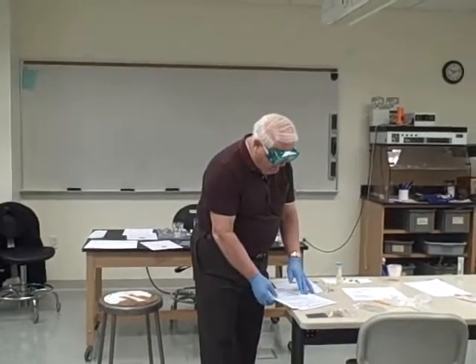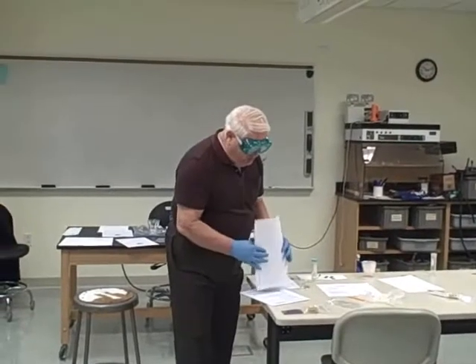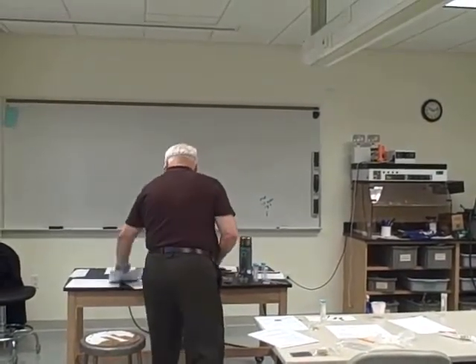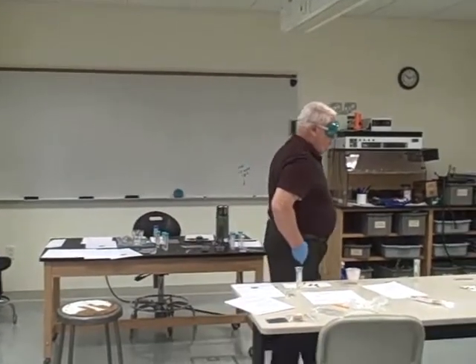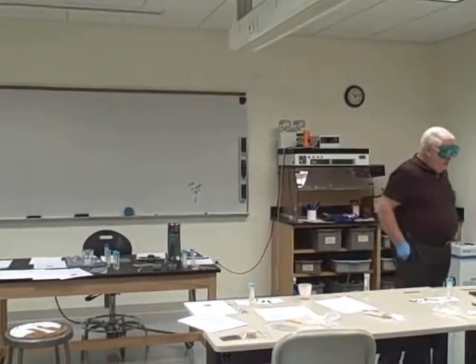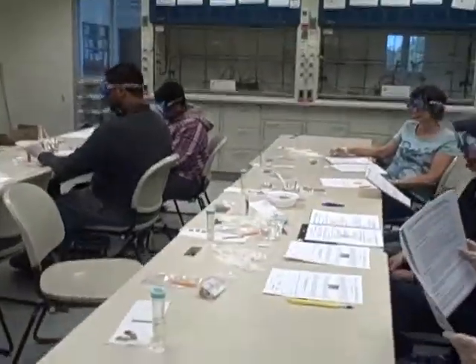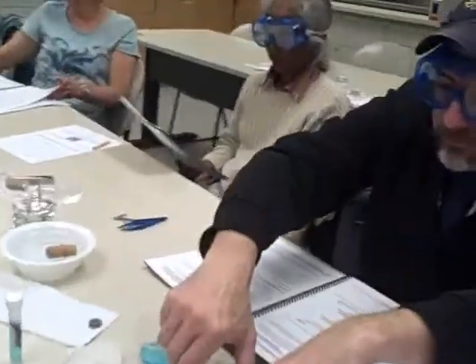Experiment number 5 is a rather interesting experiment. We're going to use metals to enhance metals. And what I like to do is I like to do part number 3 first. You've got at your table, in the middle of the table, 3 cups. One with a blue solution in it, one marked 53H, and one either blank or 53W. There's also 2 nails there.